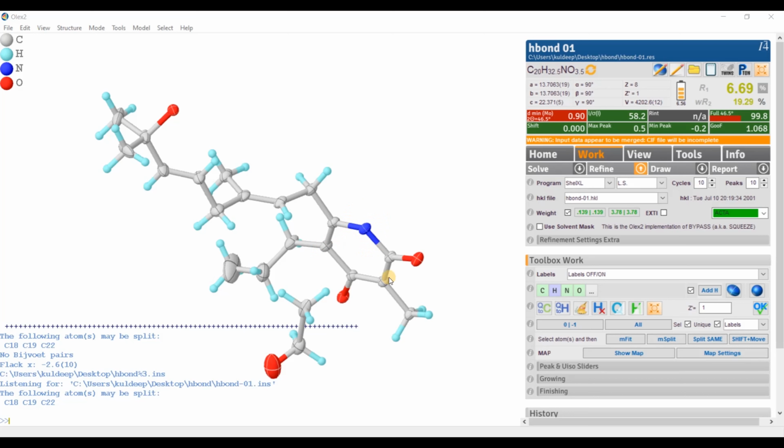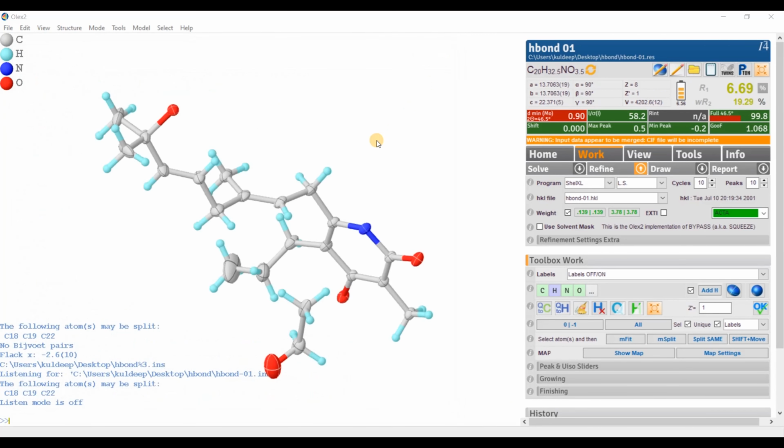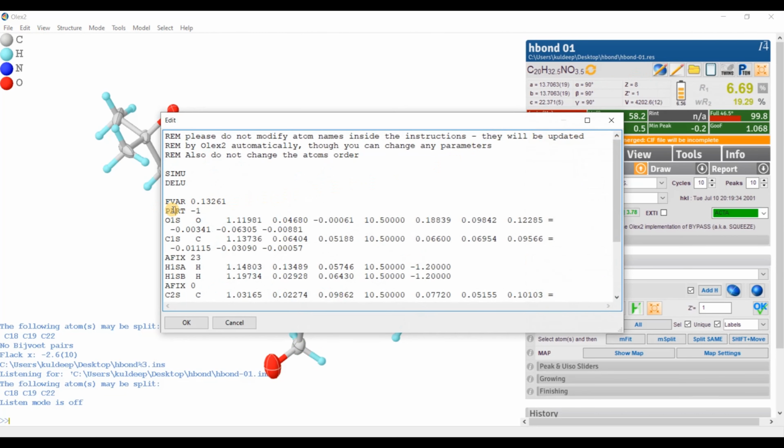The crystal diffracted relatively weakly and the data had to be truncated at 0.9 angstrom. As a result, the data to parameter ratio is not very good, which is the reason why we are using the ADP restraints SIMU and DELU for all the non-hydrogen atoms. Also, there is one ethanol molecule near a special position which is refined using the PART -1 instruction, and it is only half occupied.